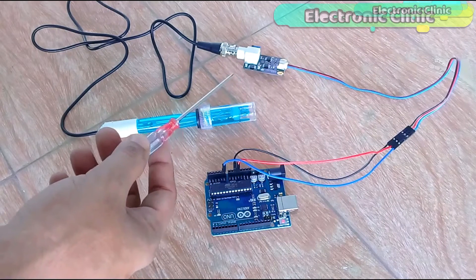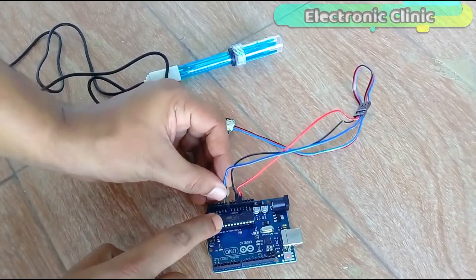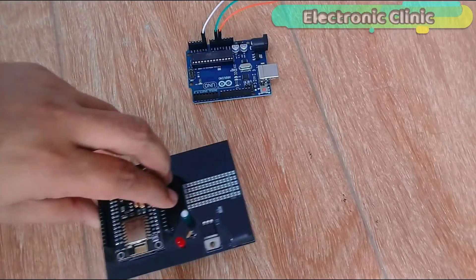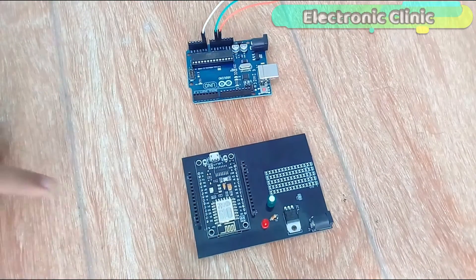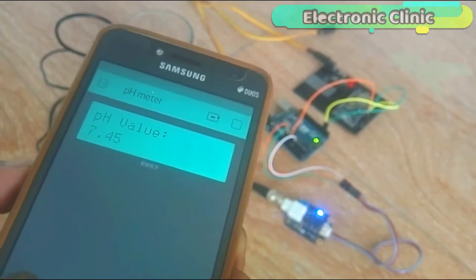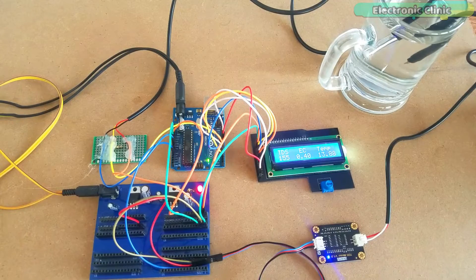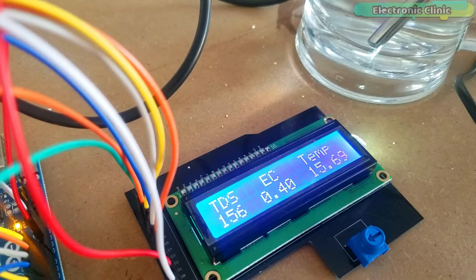Using a pH sensor and a TDS sensor, you can make a perfect water quality monitoring system. I have already used the pH sensor with Arduino and NodeMCU ESP8266 module for measuring the water quality. In today's episode, you will learn how to make a water quality monitoring system using the Gravity TDS Meter V1.0, DS18B20 waterproof one-wire digital temperature sensor, and 16x2 LCD with Arduino for measuring the TDS value.